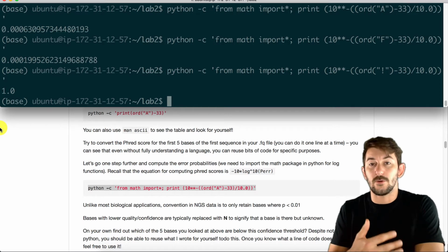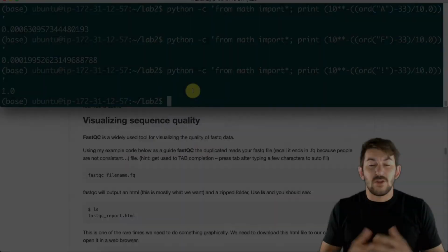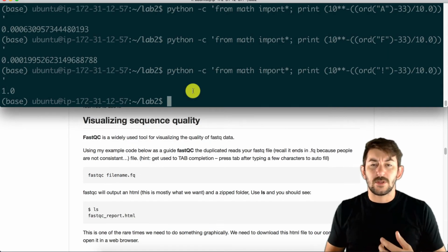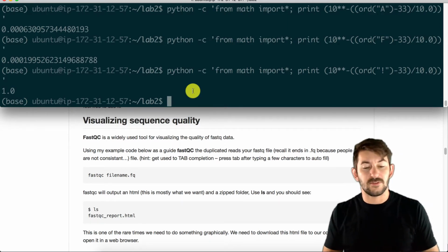the trimming that we're going to see here later, where we go through these raw reads and decide which bases to keep and which reads to keep based on how confident we are in the sequences being called correctly. Okay, next I want to talk about how we actually visualize large sequence data sets very simply, just to look at the overall quality of how our sequencing did.